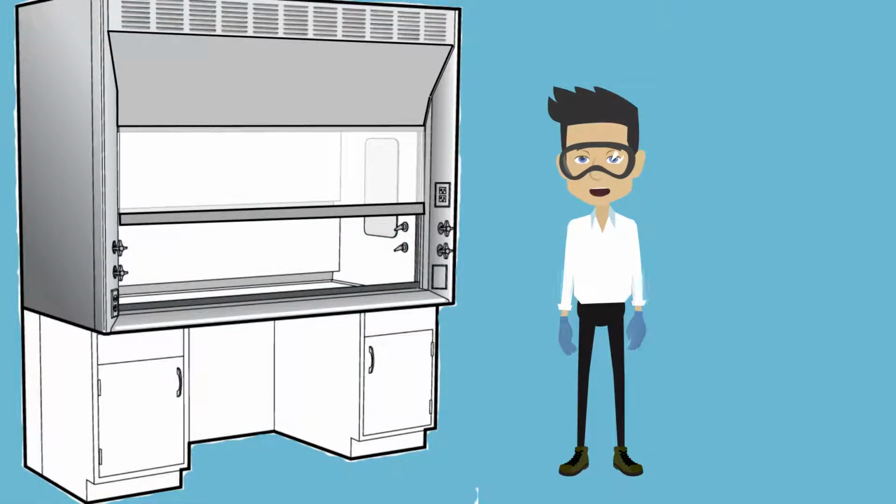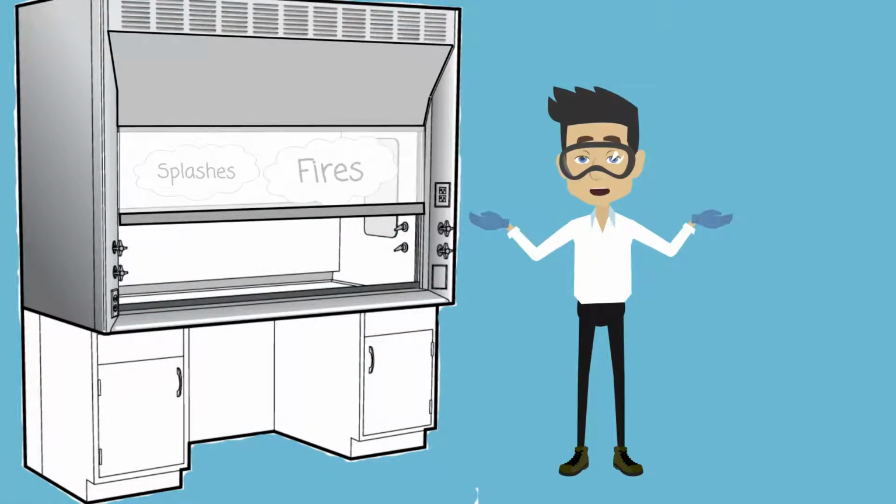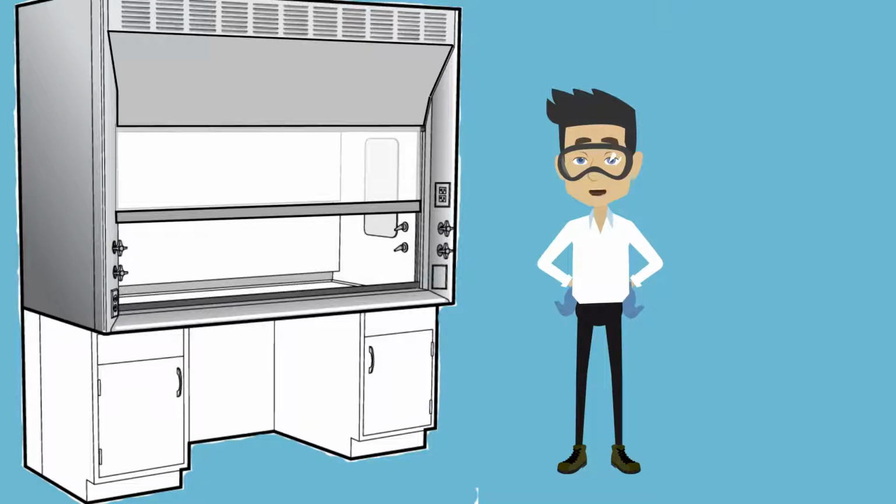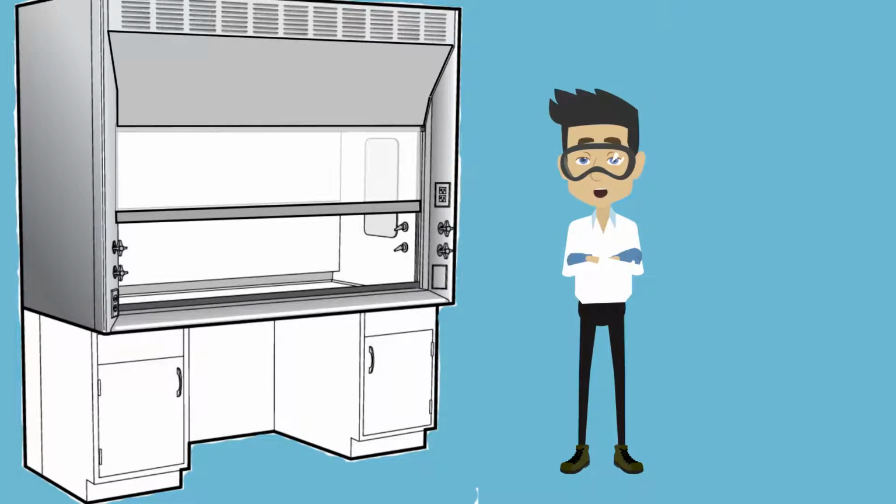The hood sash also shields you from splashes, fires, and minor explosions that could occur inside the hood. But if you don't use the hood properly and adequately analyze the hazards associated with your work activity, you won't get the full safety benefits of this important piece of equipment and you could be exposed to harmful fumes generated by your work activity. So let's talk about what you need to do to ensure it operates properly.